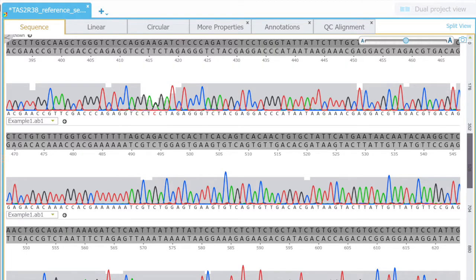This tutorial will show you how to use Genome Compiler to compare multiple DNA fragments. Remember that bitter tasteability is determined by a series of SNPs, single nucleotide polymorphisms.